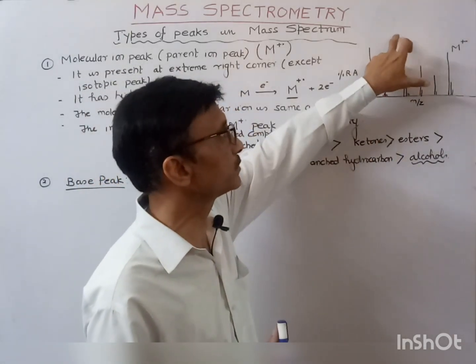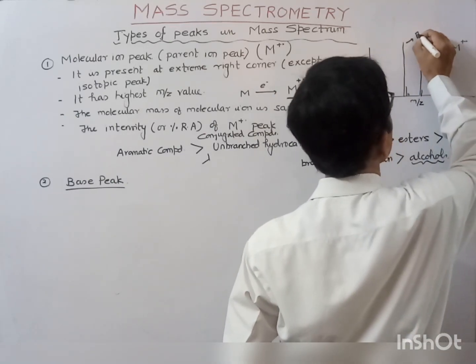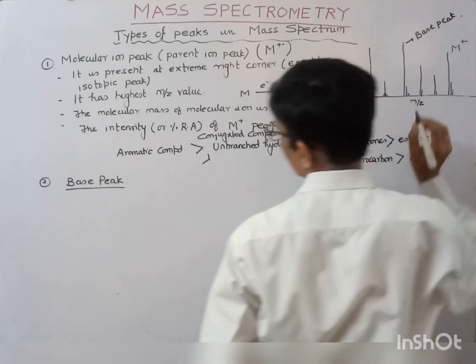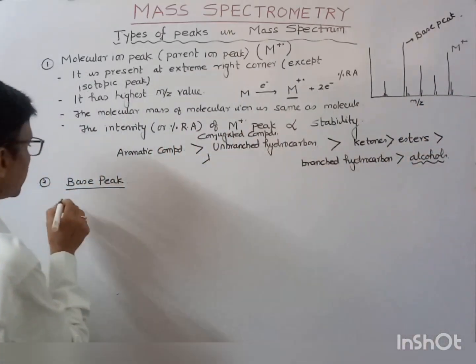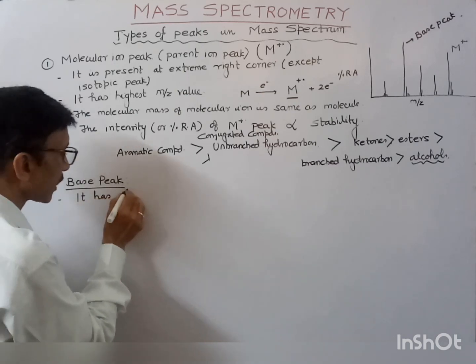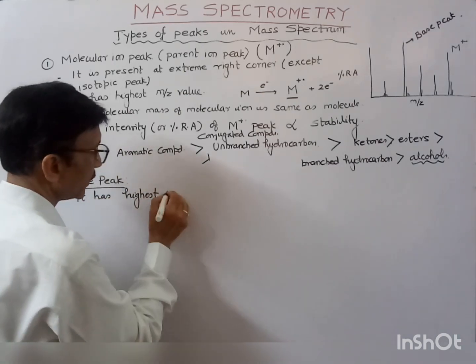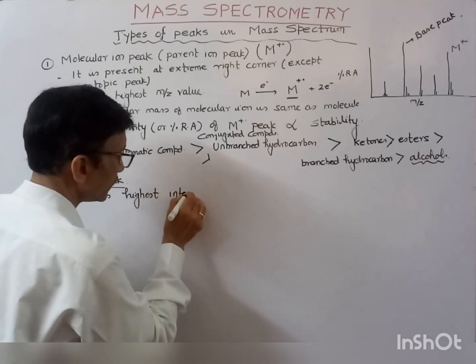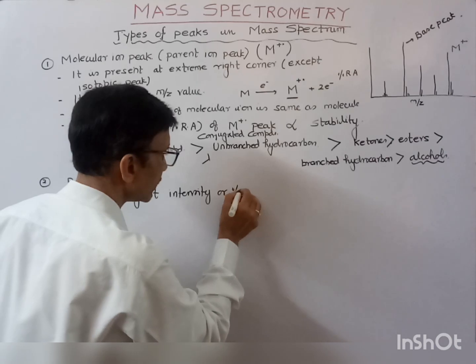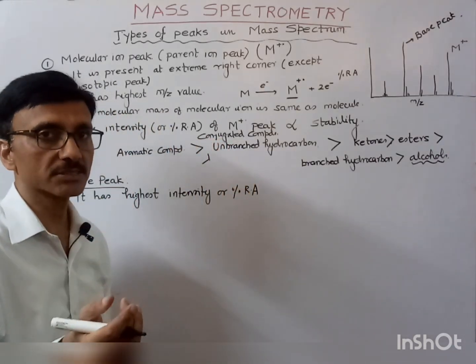So this peak is your base peak. The peak having the highest intensity, or percentage relative abundance.